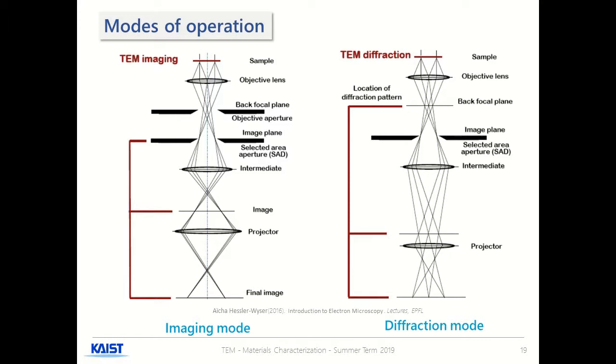So the better way to look at that specific grain is to illuminate the whole sample, but to choose only the beam from this grain to look at. The objective aperture permits to select only a certain diffraction plane to look at. A more precise example will be given later to clarify the use of the two apertures.